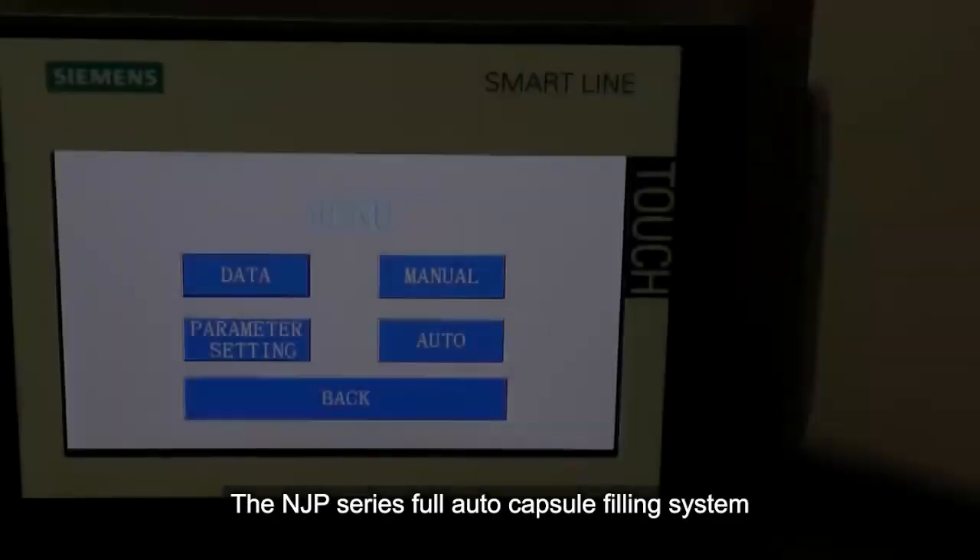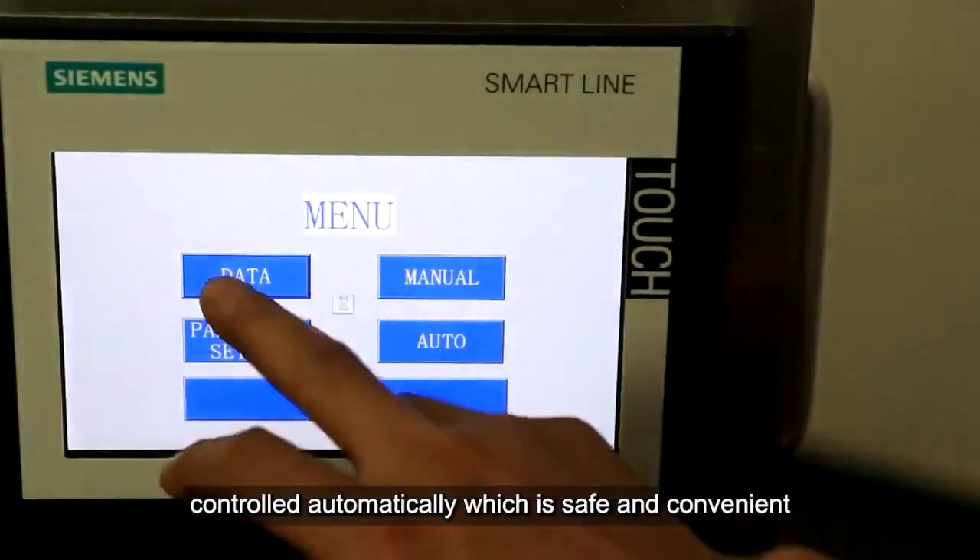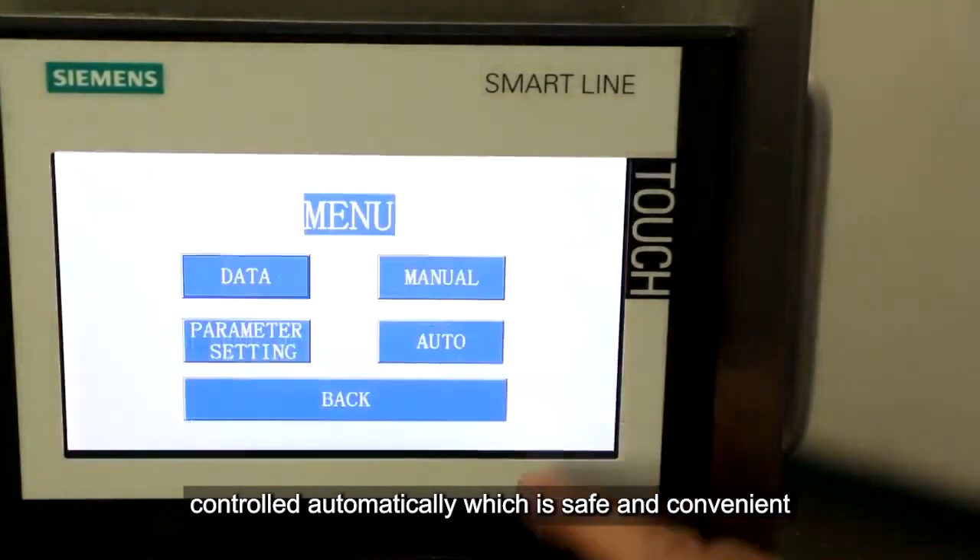The full auto capsule filling system realizes opening and locking of the capsule controlled automatically, which is safe and convenient.